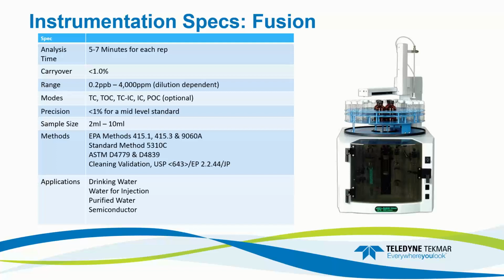Since it's a UV persulfate system, it looks at cleaner water. If you have a sample that is particulated or heavily particulated, this will not be the right choice of technique. That would be more of a wastewater type of application, and you're going to be looking at a combustion system for that.